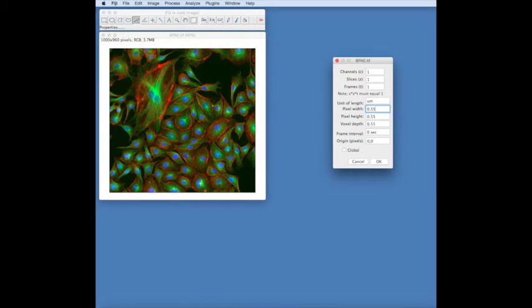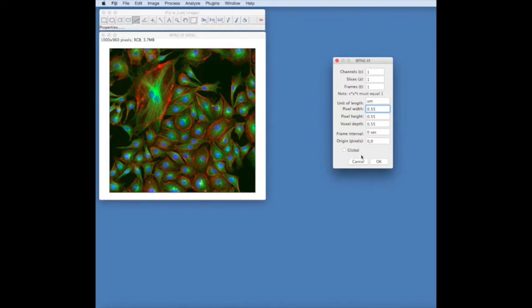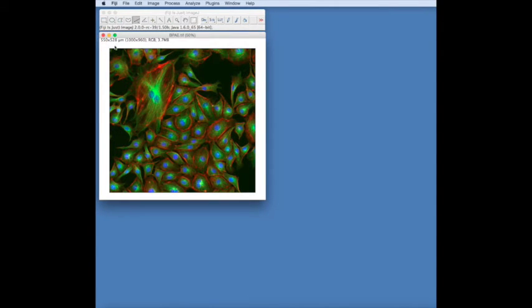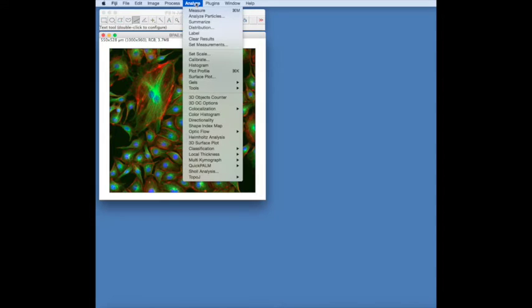We then put in a pixel value, so each pixel here is 0.55 of a micron. By selecting Global, that will apply to all of your images that you open. You can now see that this image is calibrated into microns.